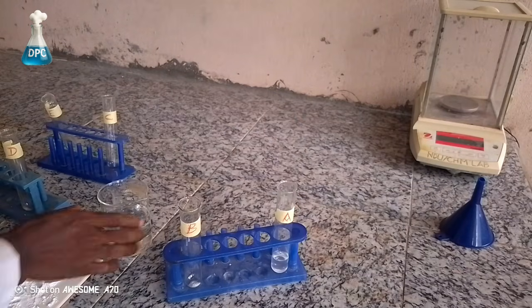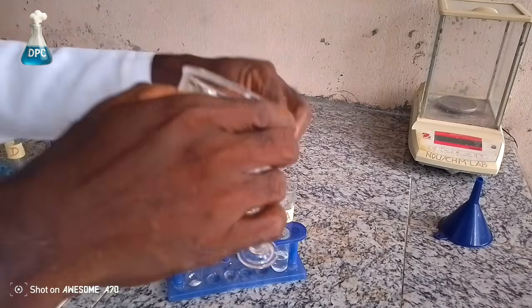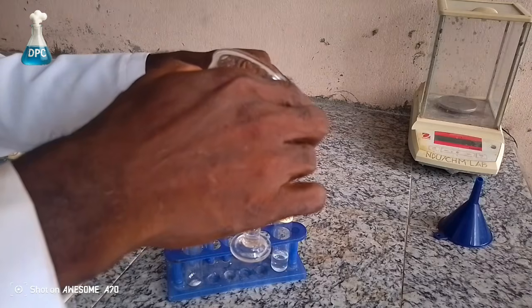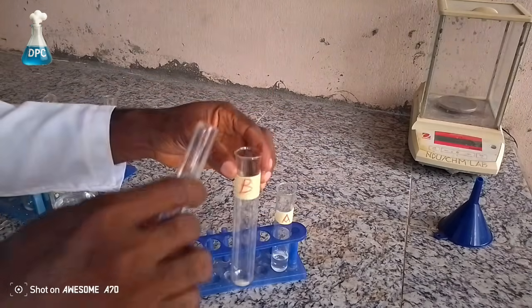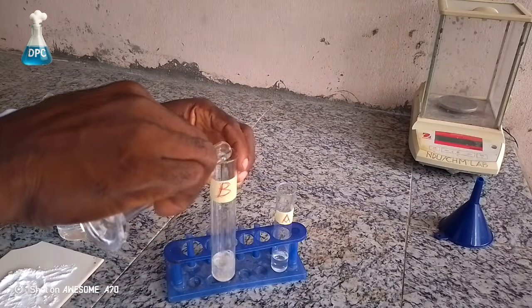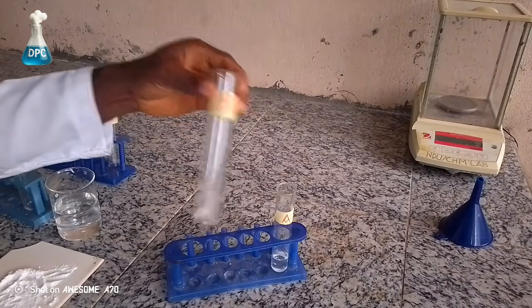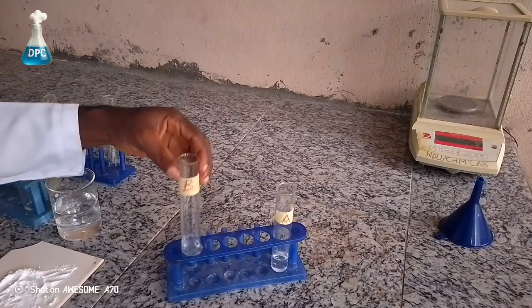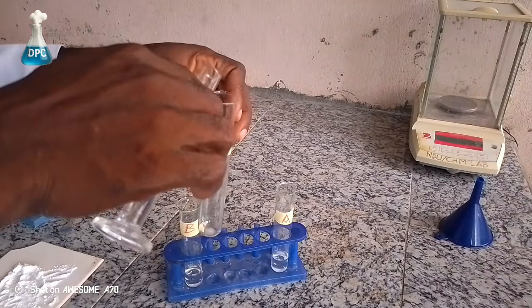A true solution is a solution where the solute is completely dissolved in the solvent, where you have a clear solution. Now 10 ml again for test tube B. Yes, you must ensure that every particle, the last particle of sodium hydrogen carbonate, is dissolved.